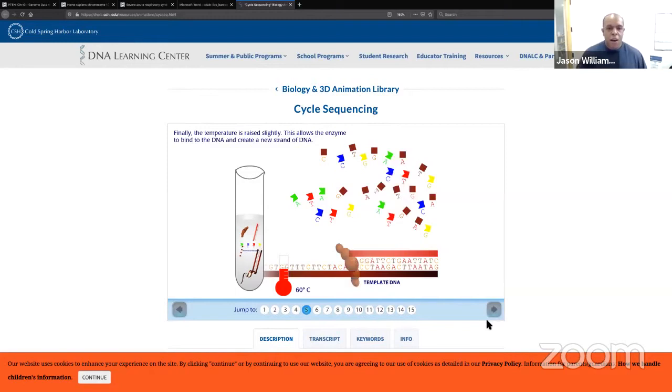And if you know what a polymerase is, great, but if you don't, there's definitely something you want to look up. The polymerase is an enzyme which actually extends DNA. It builds DNA, so it's going to incorporate those individual bases. And if you notice here, we've got bases. Some of them are brown, which are regular deoxynucleotide bases, but some of them are colored, which are those dideoxynucleotides.